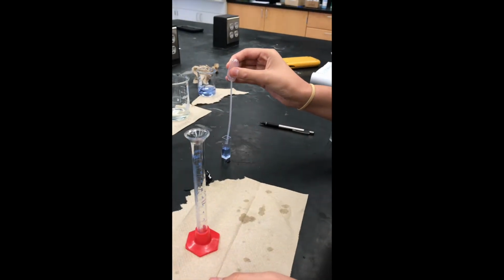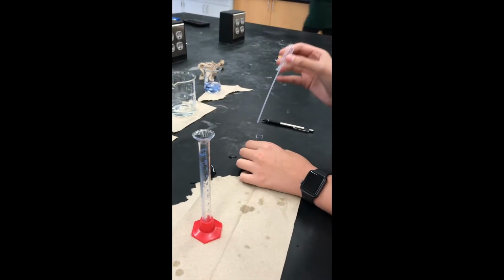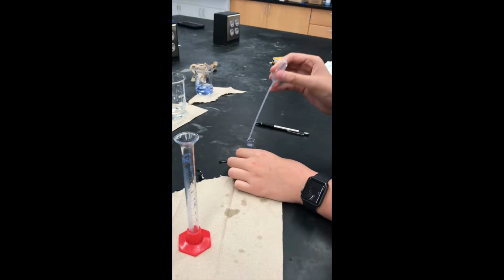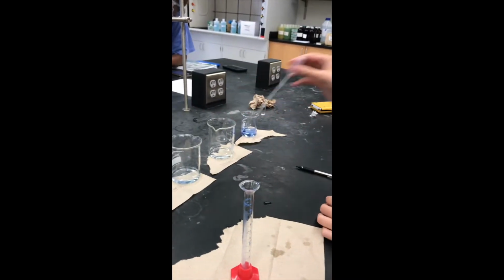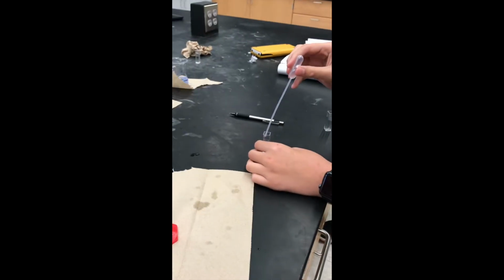We did this for each individual solution, our unknown solution, and ammonia, which functioned as our blank. Using a blank to zero the spectrophotometer is necessary so that the ammonia in our solutions does not affect the absorption value. We ended up having 6 total cuvettes to put into the spectrophotometer. Here are our solutions with their corresponding cuvettes.